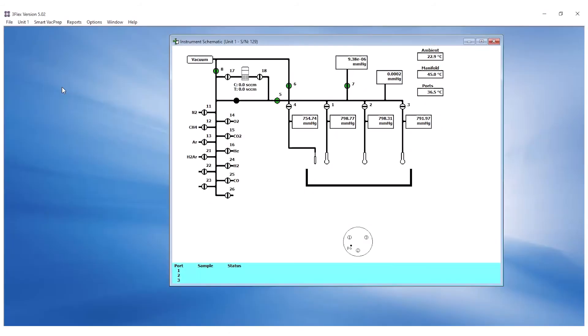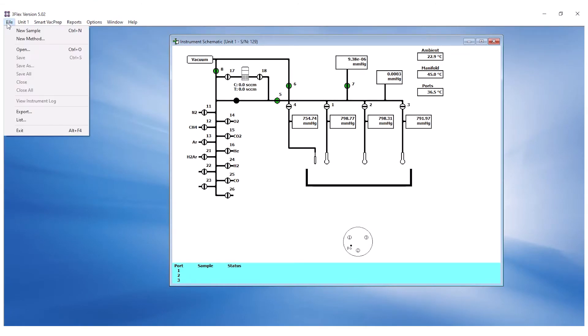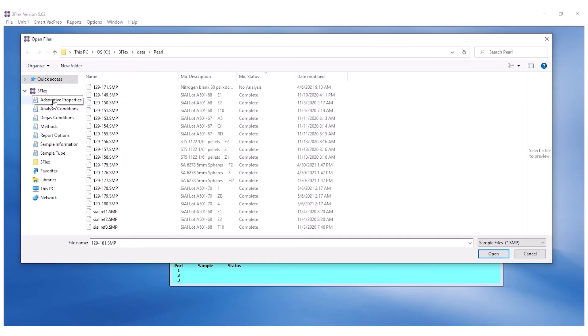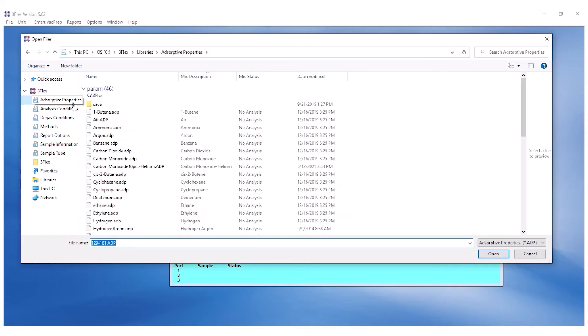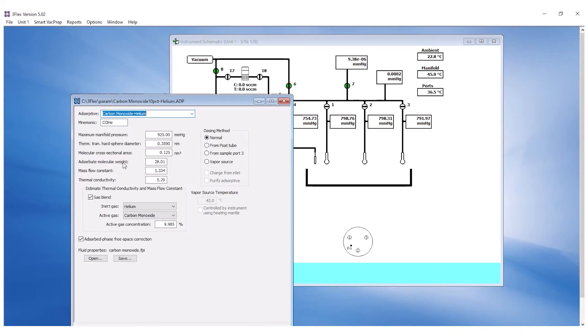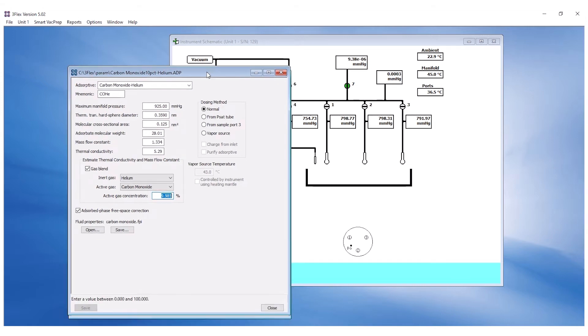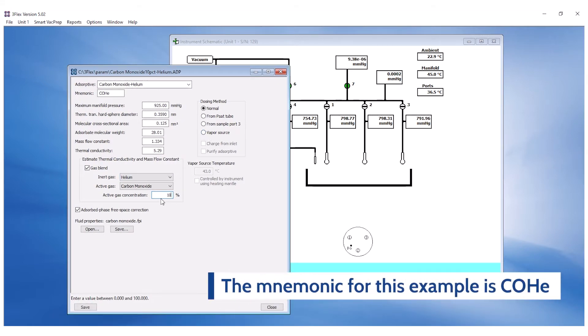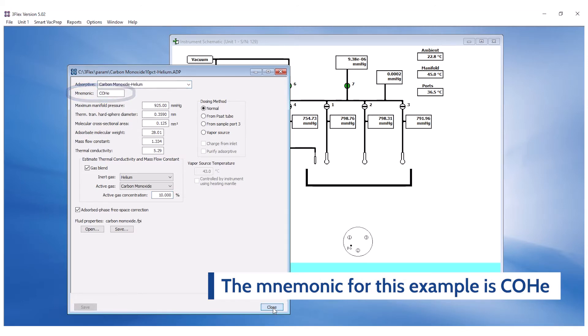If a gas blend is used, update the percentage of the active gas in the blend in the adsorptive file by going to File, Open, Adsorptive Properties. Open the corresponding adsorptive file and update the active gas concentration as listed on the Certificate of Analysis located on the gas cylinder. Note that the mnemonic for this example is labeled as COHe.